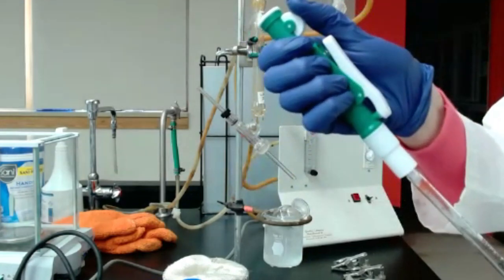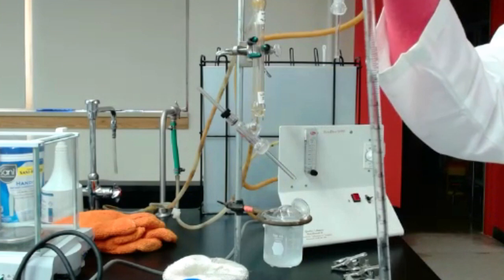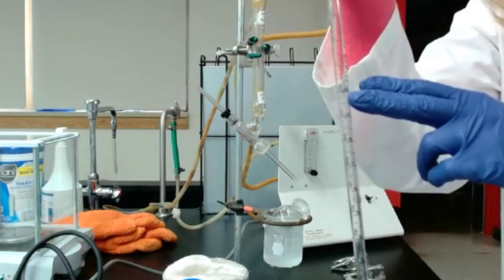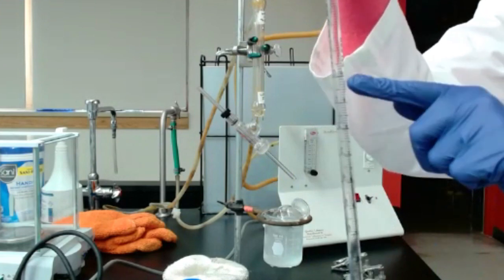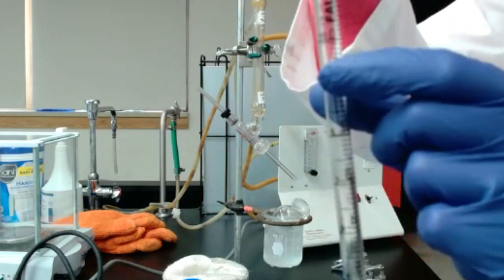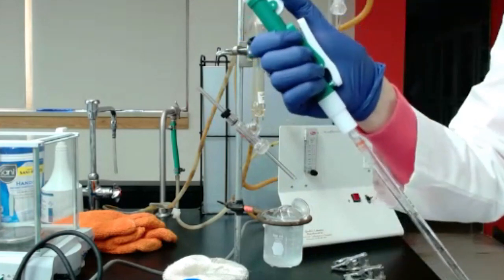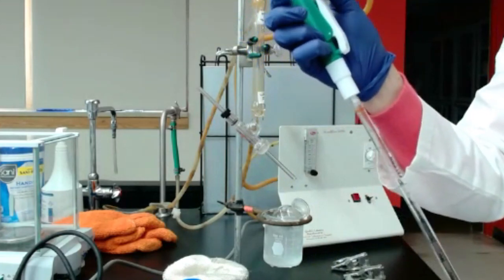All right, so you use that wheel to pipette the correct volume. We will use 20 milliliters of wine. I have only a pipette of 10 milliliters, which means I'm going to pipette twice. I will make sure I always use the correct volume. On one side, it's written 0. On the other side, it's written 10. But make sure you use that wheel to suck the wine. And then to release, you push here.